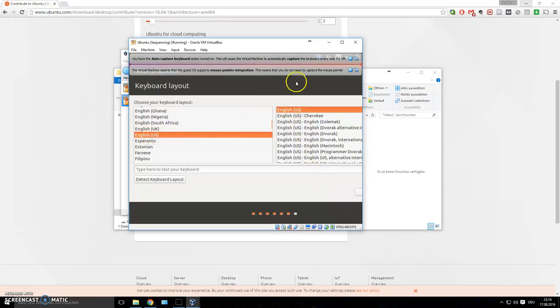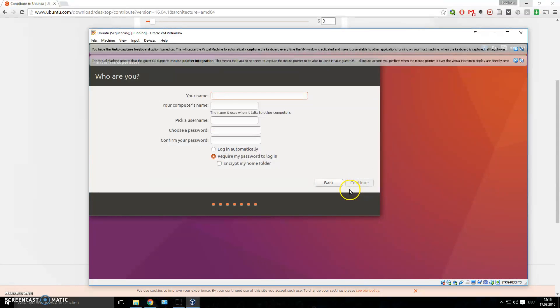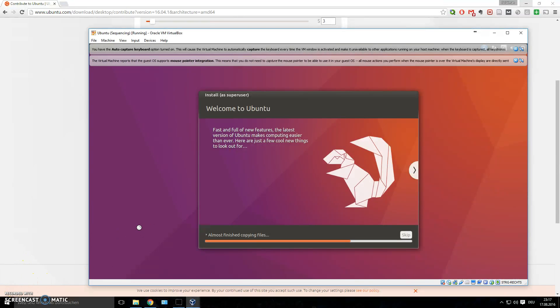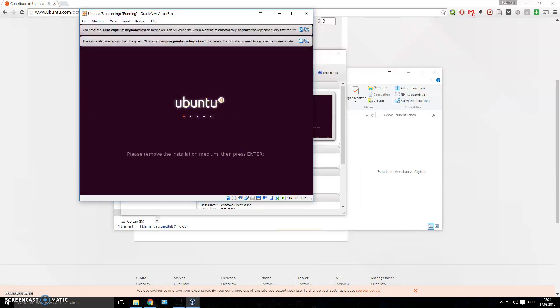Choose your timezone, fill in your name and username, and choose a password — this will be the administrator account for the virtual machine. I'm going to pause and skip through these steps. Once you've filled everything out, the installer will start copying files. Installation complete — make sure you don't rush it, especially if you checked the update option, as it takes some time. Click 'Restart Now' when done.